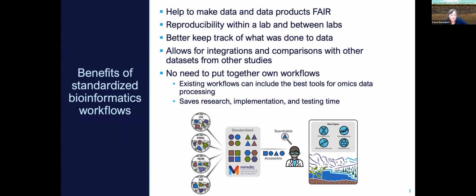So the data sets that are out there and the data products that are out there aren't comparable. We're not able to compare across studies. And so the idea of using bioinformatics workflows that are standardized allows you to utilize data from other studies as well. It also helps you keep track of what you did with your own samples and make sure that they were all processed in exactly the same way.